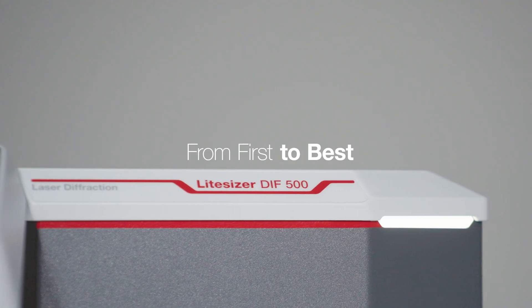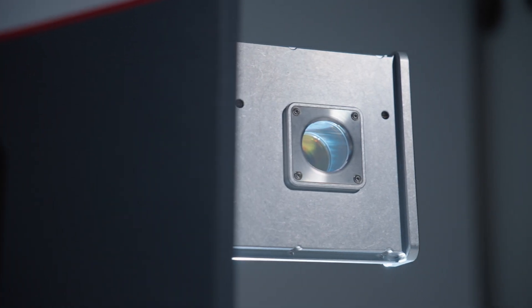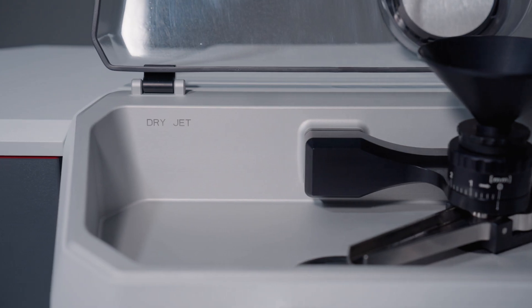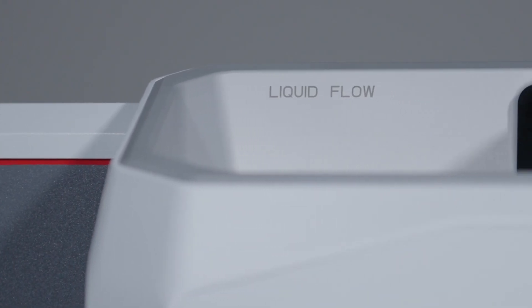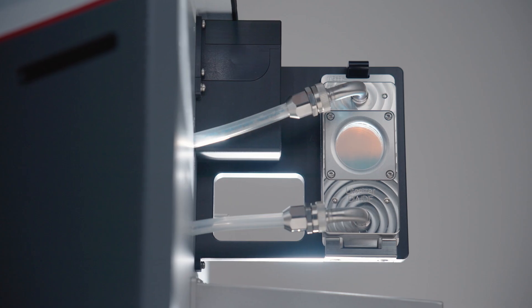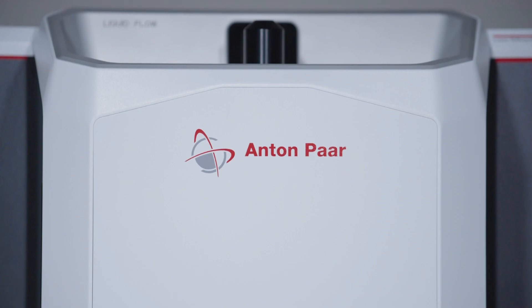Almost 60 years of laser diffraction expertise drive this tried and tested particle sizer. A new, more sophisticated instrument that delivers even better results. Light Sizer DIF series with a range from 0.01 micrometers to 3.5 millimeters.